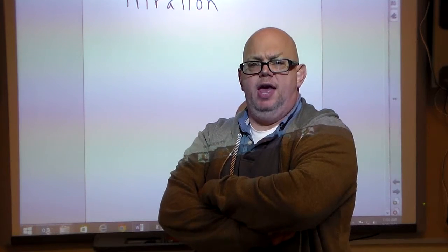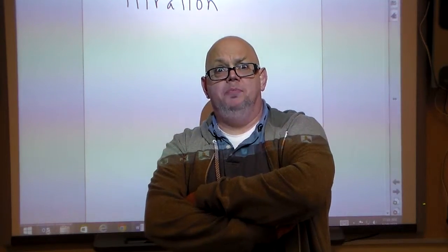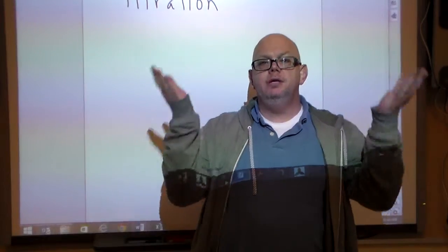You've seen me in such fine, quality, epic chemistry educational videos as acid and base, they're opposites of each other, and how do we titrate acids and bases? Do we drop the base and drop the acid at the same time? Today we're going to be looking at the idea of titration.